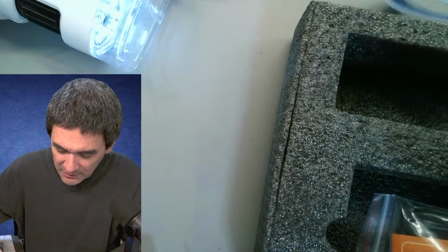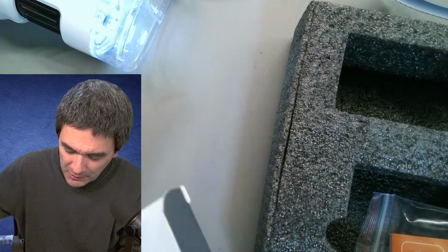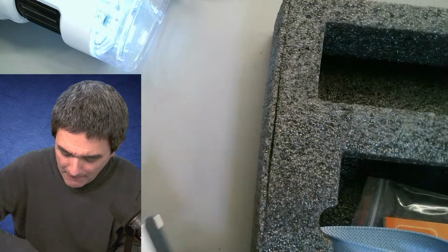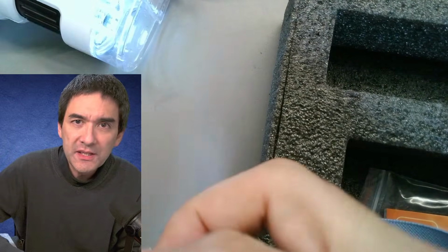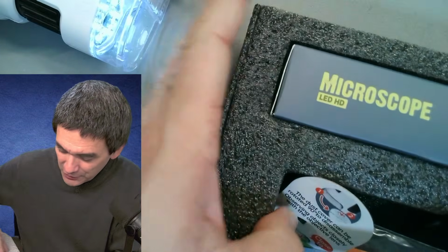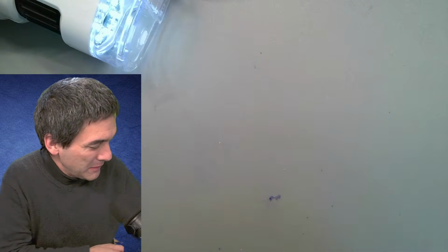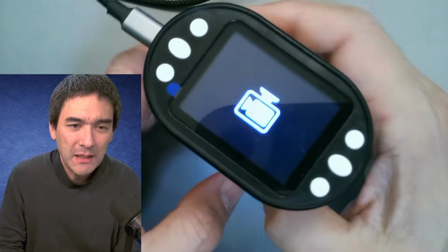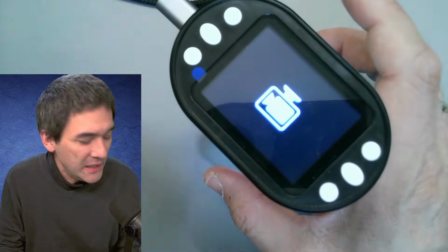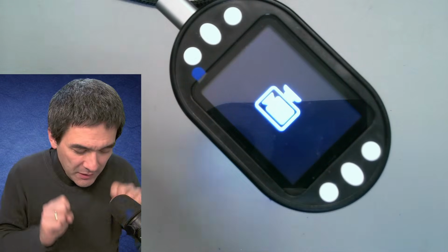But I want to look at a couple of other slides with you for comparison, because, what shall I say? One thing surprises me positively, how technology progresses over the years. A couple of years ago, this would probably not have been imaginable. But at the same time, the image quality, of course, is not able to keep up with what I call a real microscope.